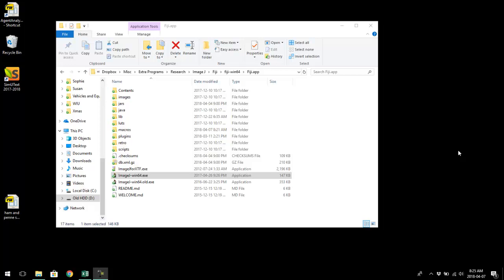I am going to talk a little bit about using ImageJ to do back calculations from images of otoliths. I've written a macro that makes this a little bit easier, so let's walk through that and I'll show you what I'm doing.